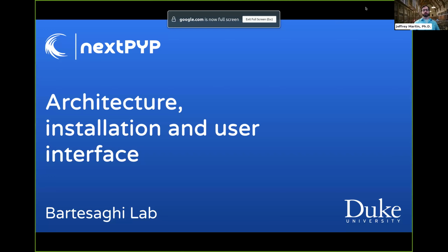All right. Good morning. My name is Jeff Martin. I'm one of the software developers that works on nextPYP. This morning, I'm going to talk to you about the overall architecture of our software, how to install it, what the user interface looks like, and a few other goodies too.